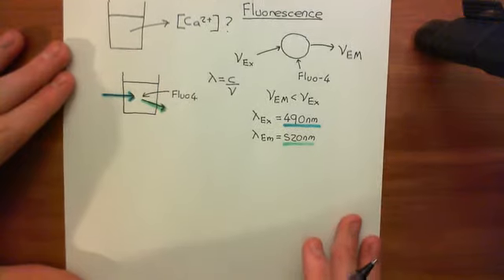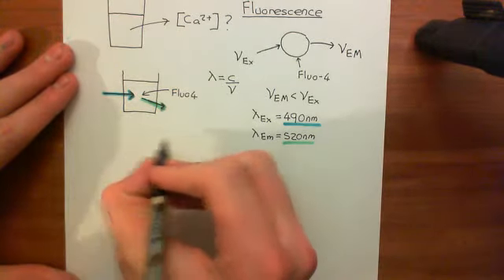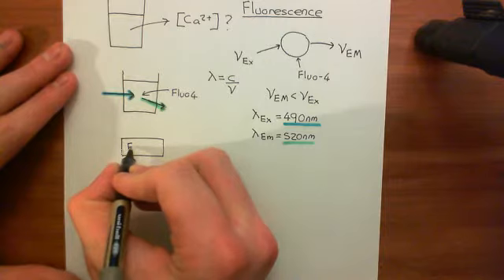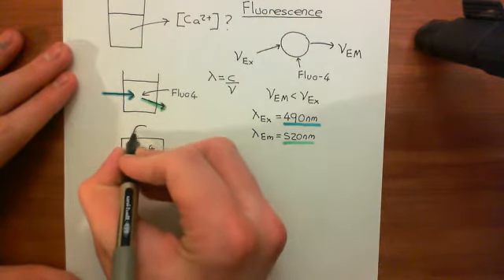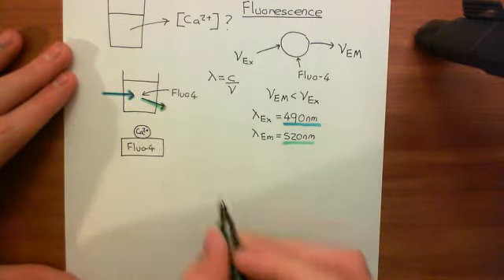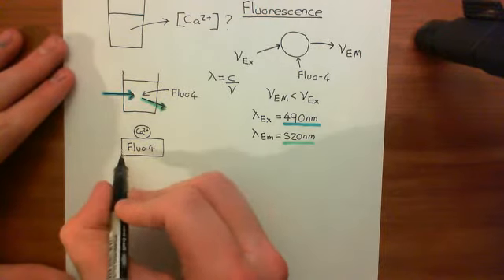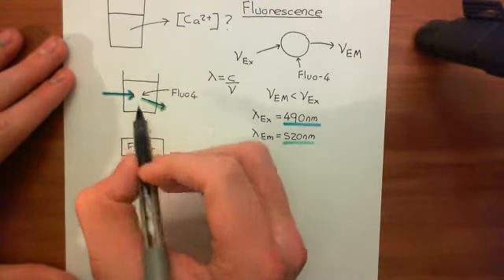Now, basically this is the amazing thing. Fluo-4 can bind to calcium. Okay, so if we represent our Fluo-4 molecule as this rectangle here, okay, it can bind to a calcium ion. So here is our calcium ion. So it can bind to a calcium ion, and basically when you have this Fluo-4 calcium ion complex here, this is far better at performing fluorescence.